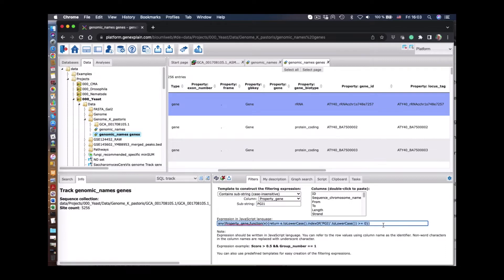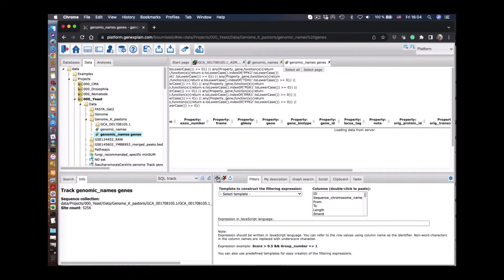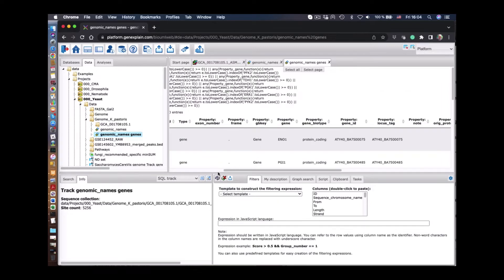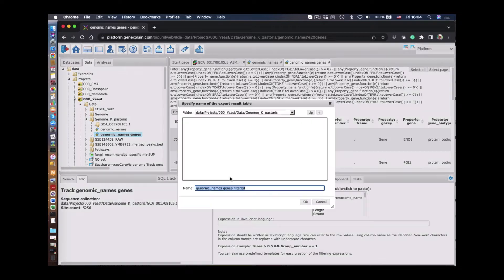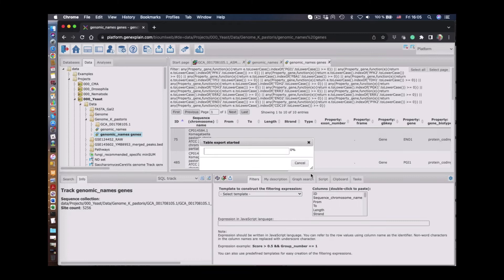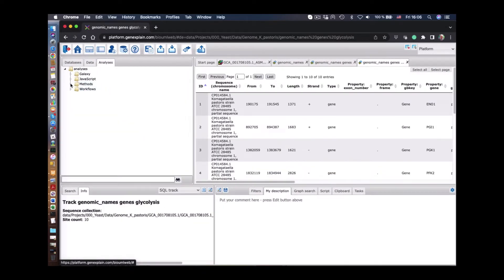Each gene has to be selected individually and we build a search term which includes all the genes in the terms. We apply the search and now we see 10 genes which belong to this glycolysis pathway. We can save this as a separate annotation file for these 10 genes.